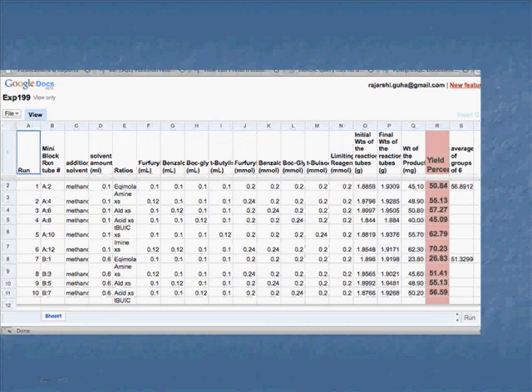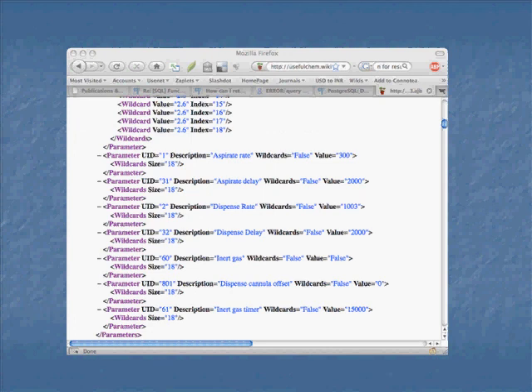So the idea here is that you could have true crowdsourcing, where people from around the world who have expertise in experimental design of this experiment could request some experiments to be done within the confines of our experimental setup, and because we're making our results public, they could also benefit from that without us even really being fully aware of everything that's going on. So anyways, that's sort of the bigger picture of this. And the machine, of course, understands XML, so that makes it much, much easier than trying to read the human-generated logs. That's the one advantage that we have with machines, obviously.